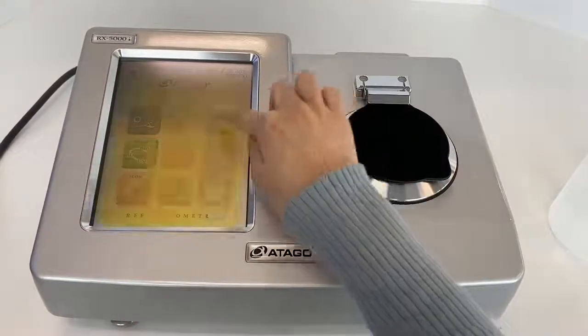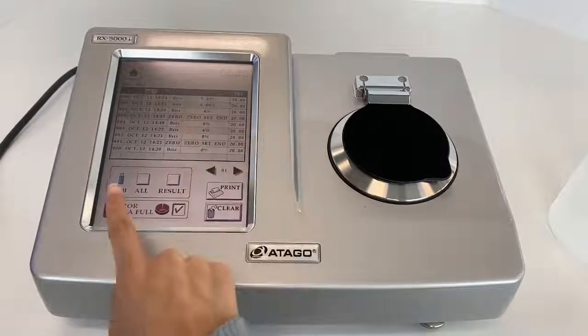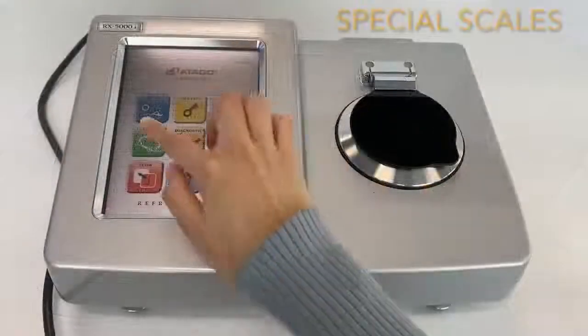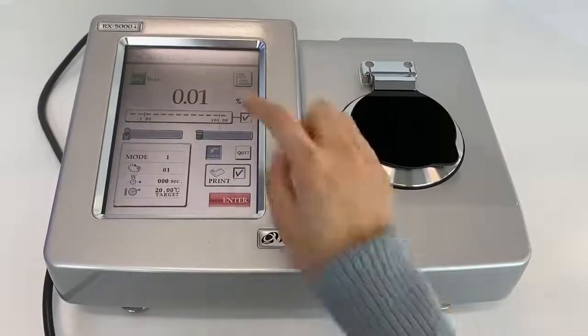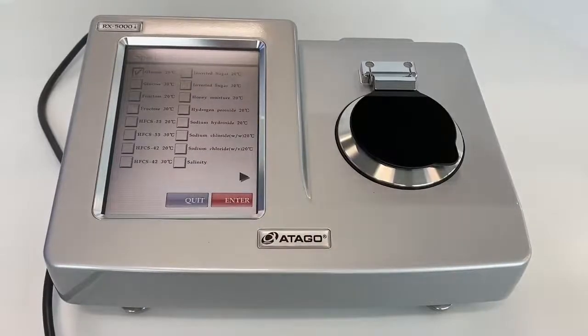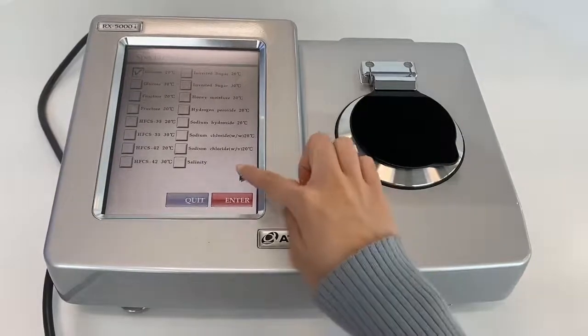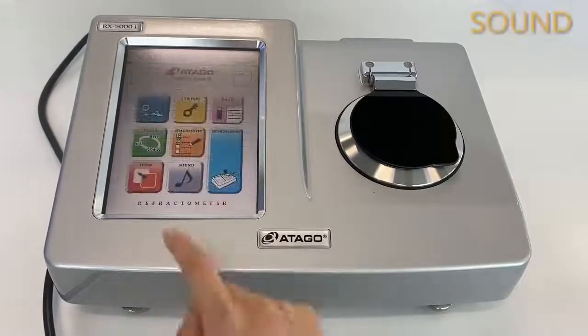You can see the measurement history on this screen. If you want to output the data, you can move to that display and output as needed. RxI has pre-programmed special scales — about 20 scales. Not only Brix and refractive index, it includes glucose, fructose, sodium chloride, and other special scales that are already programmed, so you don't have to input values yourself.